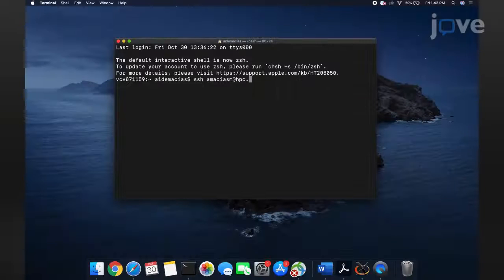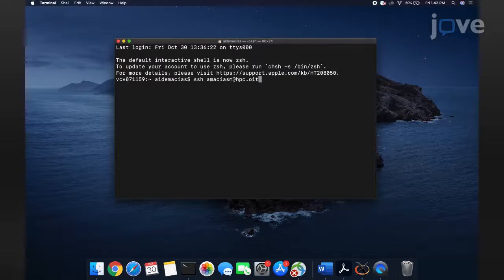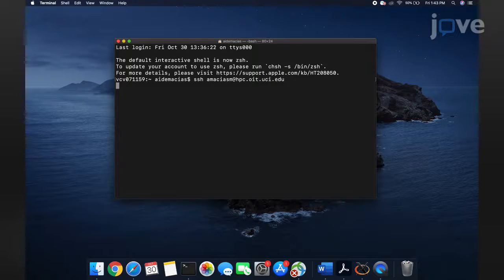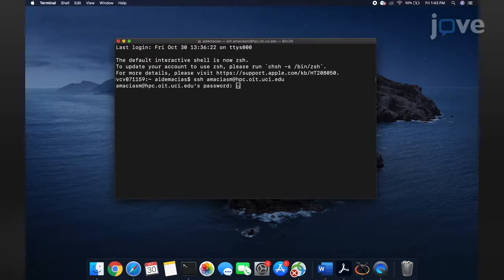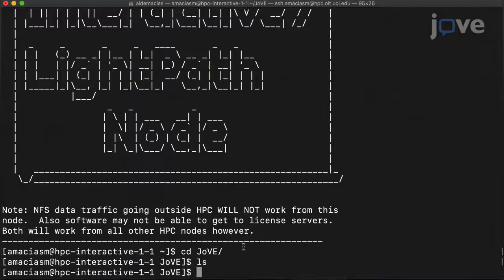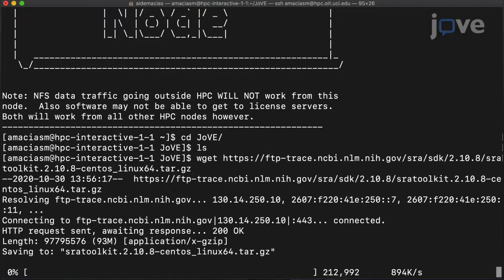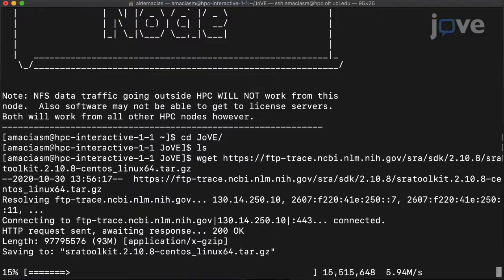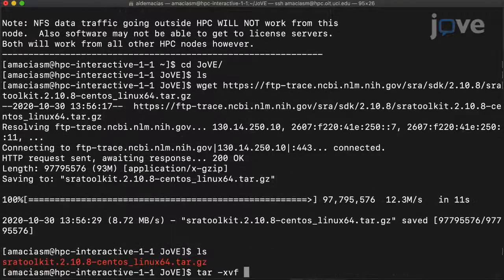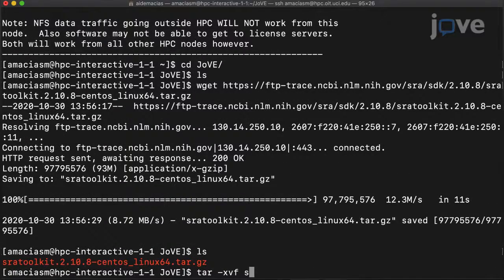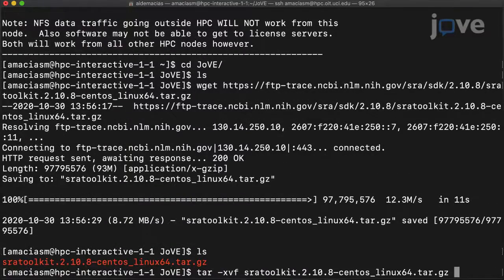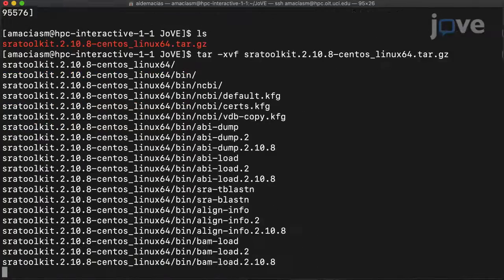To begin, log in to the computer cluster account on a terminal or PuTTY application window. On the terminal, download SRA Toolkit version 2.8.1 using WGET, then finish installing the program.